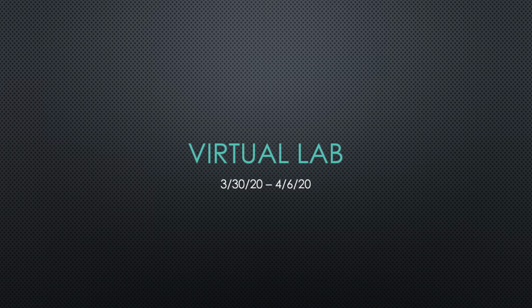In addition to the lab questions, you will begin to receive lab results to interpret that will help you identify an unknown bacterium. We will use DNA sequences and free tools available on the internet to confirm the ID of your unknown.